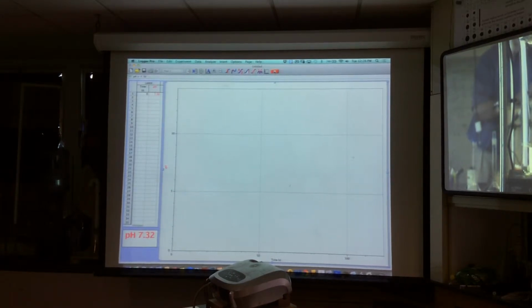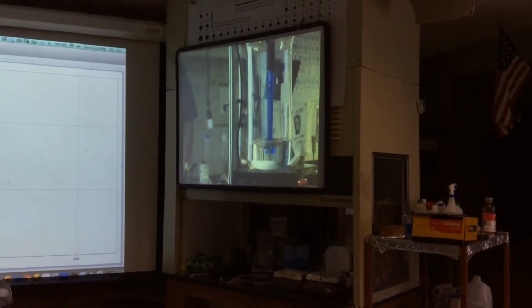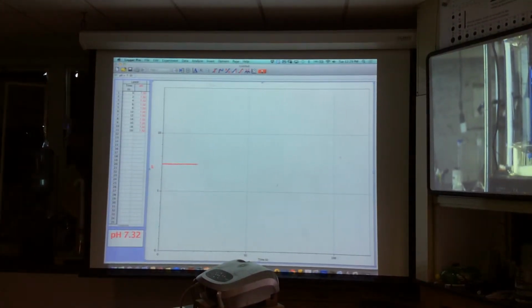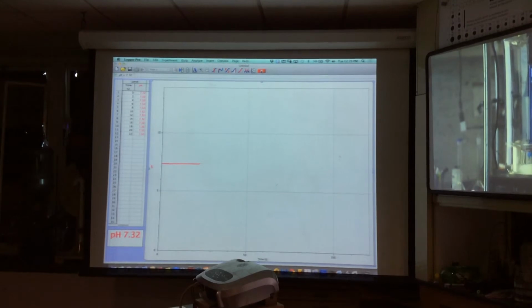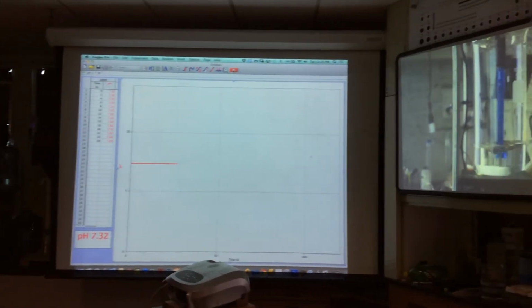It's about 7. And as I collect, you can see that I'm at a pH of about 7. Now of course we know why it's about a pH of 7, because I have pure water in there. Pure water breaks apart into an equal amount of H pluses and, of course, OH minuses. Now, it's not exactly 7 because I didn't quite calibrate. Well, I did calibrate.